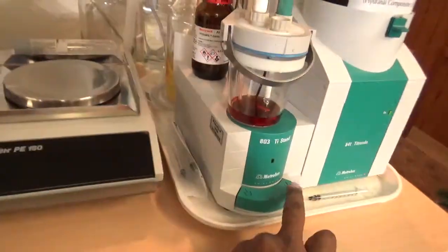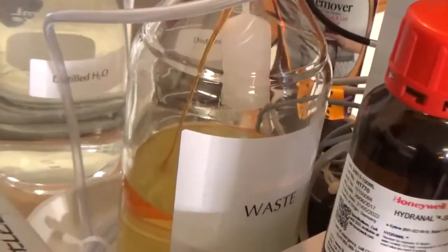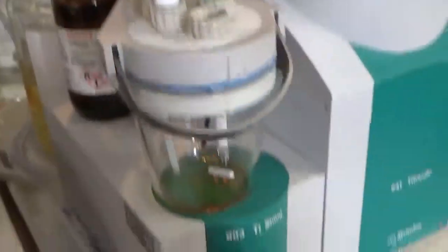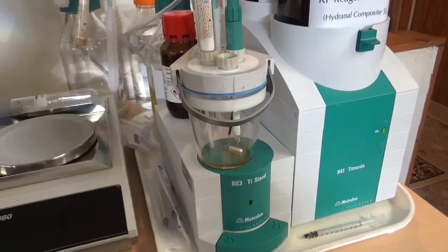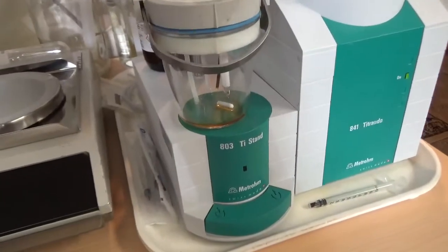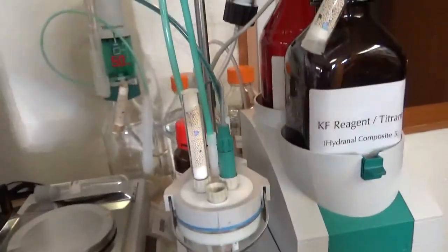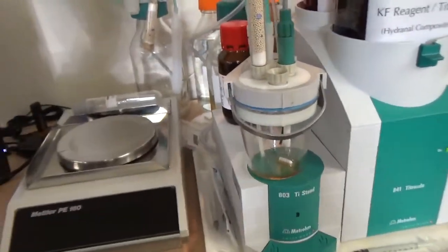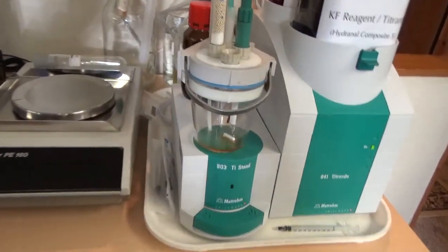At the end of the titration, discard the solution by pressing exit, and the cell is ready for the next sample. Every time you insert a new sample: take a fresh batch of ethanol solvent, condition it with the Hydranal titrant, and after conditioning is done, add your sample to determine moisture content. After titration, clean the cell again for the next sample. This completes the overview of Karl Fischer, potentiometric chloride, and acid-base titration using Metrohm equipment.